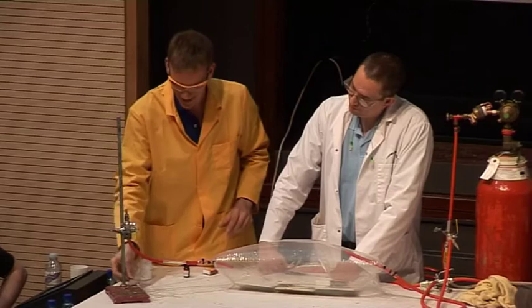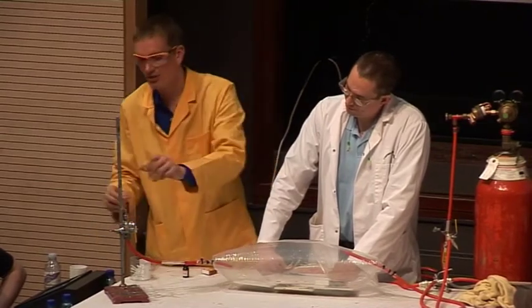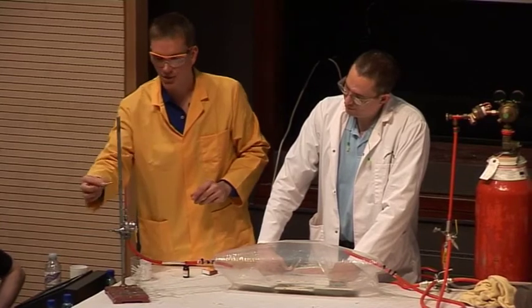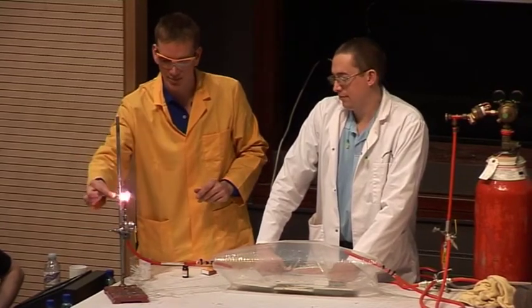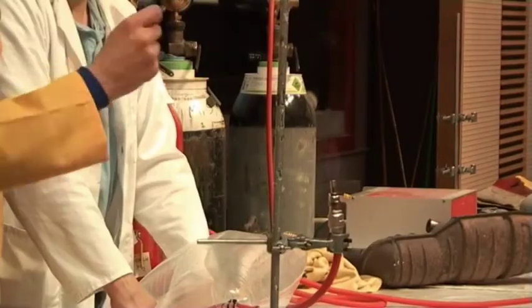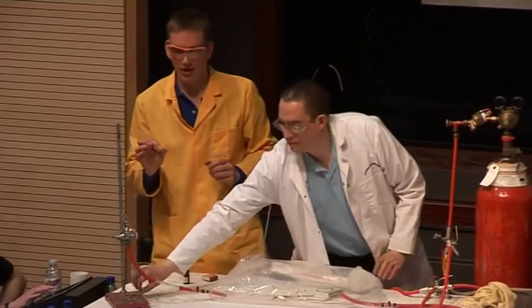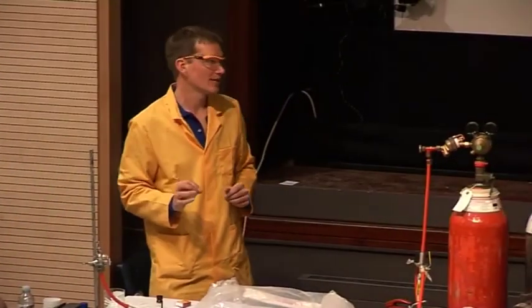There we are. It did indeed catch light. I can show this — it is burning. The flame is very difficult to see, but I can light a match in the flame that's now burning. So the hydrogen has caught light with no flames whatsoever, using the very finely divided palladium metal catalyst.